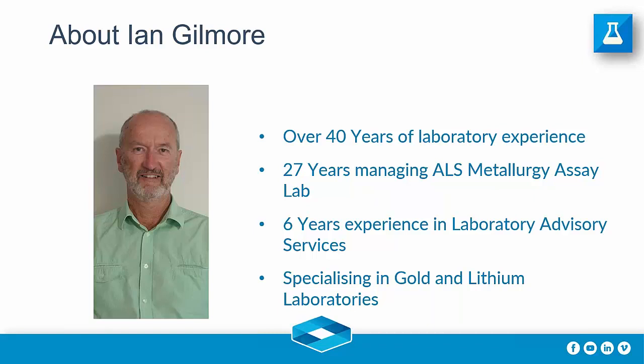Firstly, as you've already had me introduced, this is just a repetition of what came before. I've spent my whole life in the laboratory industry. Started out in soil science, UWA, Pilbara Labs in New Guinea, Pilbara Labs in Perth, obviously, and went to ALS Metallurgy for 27 years. The lab started out at ALS Metallurgy, or Amtech, as a very small lab, grew to about 80-odd people. I think it's now around about 35. Very complex laboratory, lots of instruments, different sorts, XRF, ICP, ICP-MS, and so on and so forth. It's probably a little bit smaller than it used to be, but it's a very full laboratory in terms of procedures that are used.